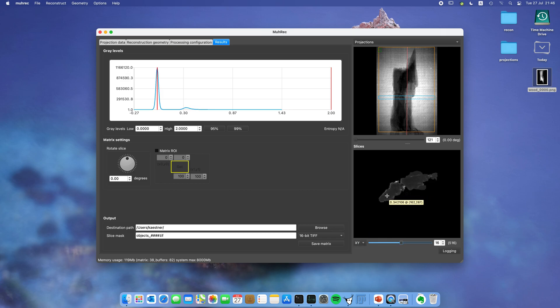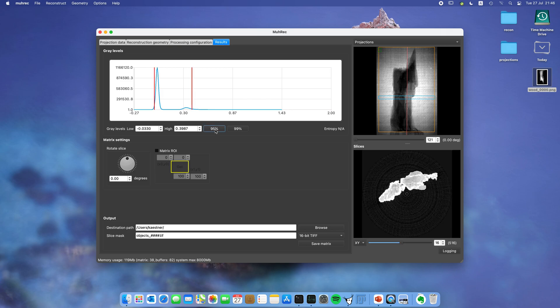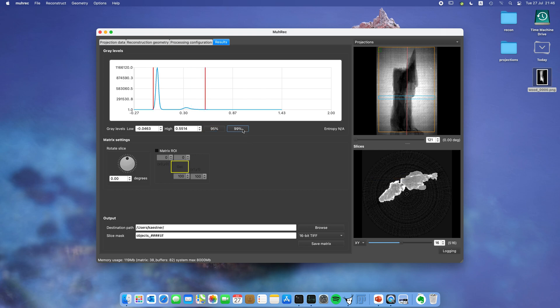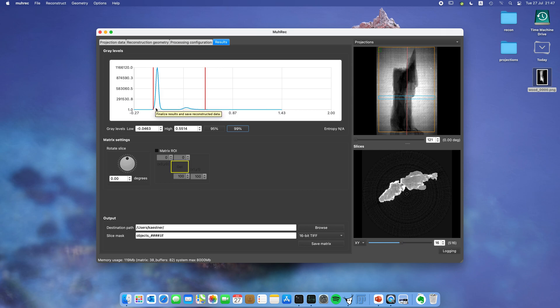Now you can see that it's relatively dark. You may want to change the contrast, and for that we have different possibilities. One is to select something like 95 percent. Then you see it's very bright. 99 percent less bright. But you can see that there is pretty much burn out in these regions which are very bright, which are not actually captured within the 99 percent. Looking at the histogram you can see there is a long tail out here.